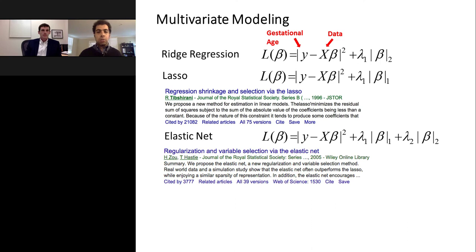That second term to the right of the equation is basically making sure that the model remains constrained, that the model doesn't get too big. We can make the model even more simplified by using an L1 norm instead of an L2 norm. What that does is that it simplifies the model to use only the measurements that are absolutely necessary for making a prediction.